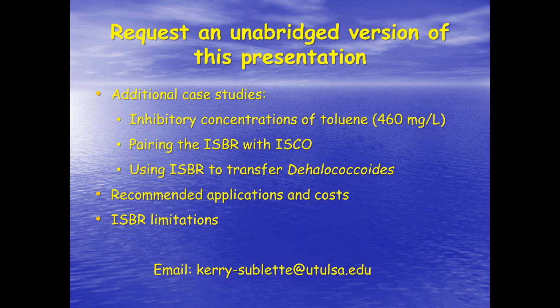We have looked at quite a few of the co-metabolic pathways. For propane degradation, we can look at the propane monooxygenase gene to see if that's being stimulated. We have actually been doing a lot of work with John Wilson and Todd Wiedemeyer looking at some co-metabolic degradation for a startup project that they were involved in. They're going to be presenting this data at the Battelle conference. And one thing that was interesting is we found that the phenol hydroxylase gene tracked really well with some chlorinated ethene degradation in the studies that they did. And so we think that may be a really important gene for us to look at for co-metabolism.